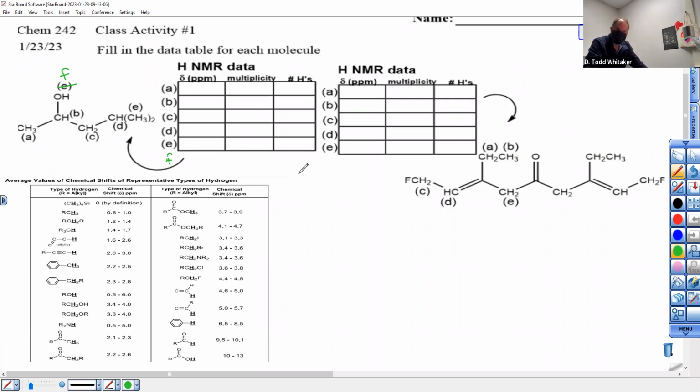The 3 questions are, and I will interpret them here. This first column, I call this question, where is the peak? Like, what number does the peak have? And that's based on its chemical environment. So you watch the lecture videos and you hear me talking about things like shielding and de-shielding and inductive effects. I'm not going to talk about those now, but you should know that those words, when you watch this video again, need to be learned.